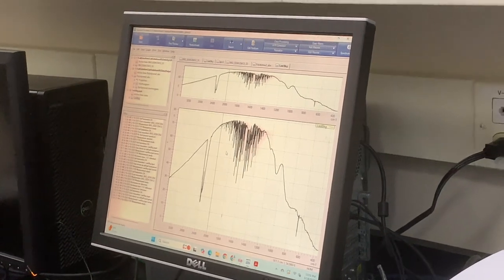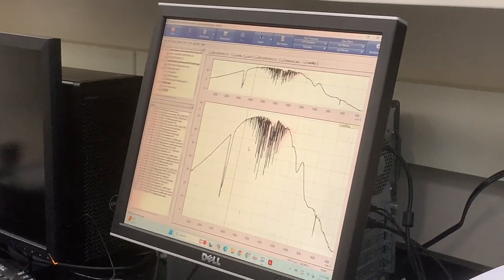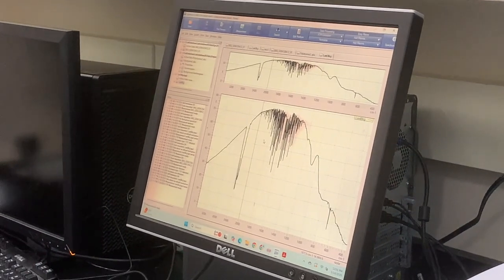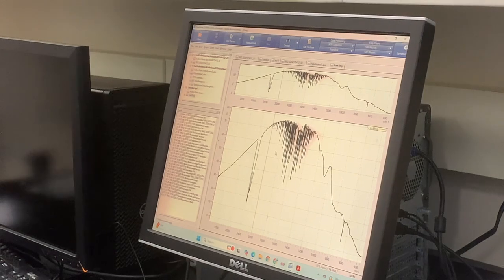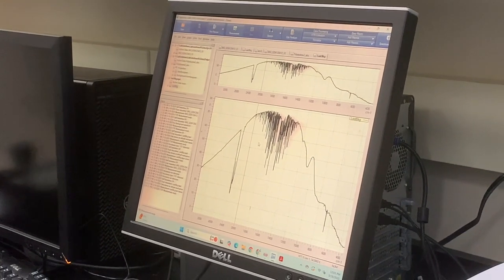So the orange light needs to stay on. That warning is just telling you. Is it like the window getting foggy? Yeah, it's actually more than that, it's the other optics inside as well, because this system heavily relies on those mirrors to do the job. Exactly. So it's getting foggy, and once it gets cloudy, our light is now bouncing in a strange way. Okay, so now we're done.